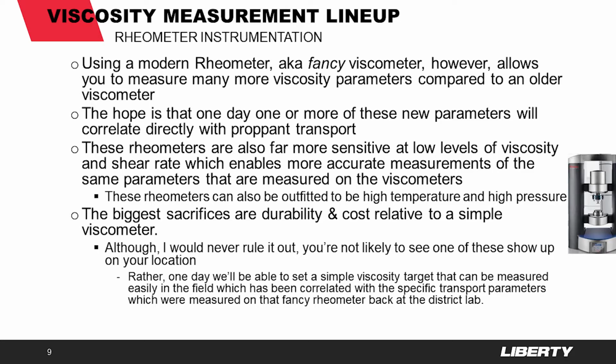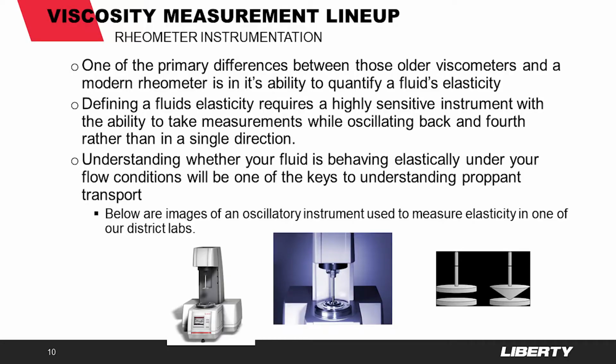Although I would never rule it out, you're not likely to see one of these show up on your location. Rather, one day we'll be able to set a simple viscosity target that can be measured easily in the field, which has been correlated with the specific transport parameters which were measured on that fancy rheometer back at the district lab.